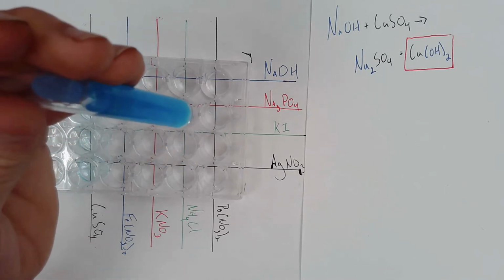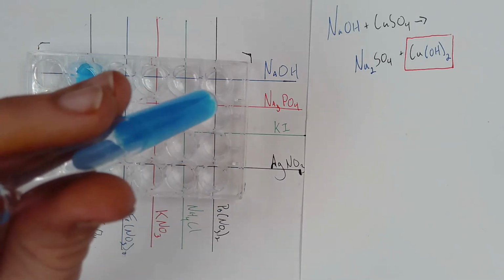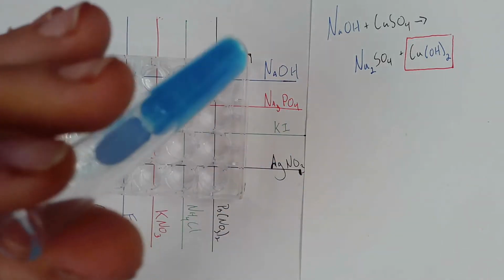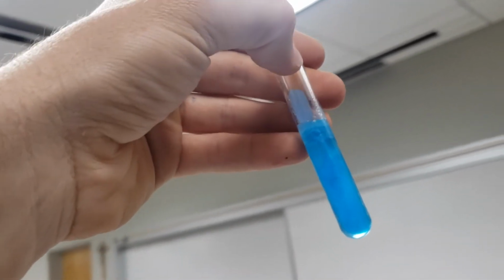Let's cut this for a second and let me show you how a chemist would actually deal with this. Because I'm not sure that's a solid or a weird mixture. I predicted it's a solid. I've seen it enough times that it's a solid, but let's prove it's a solid. All right, so as I hold it up to the light here, it does look kind of solid. And as I bring it closer to the camera here, you can see it's kind of like this opalescent, viscous gel, but I'm not sure that convinces me that's a solid yet, right? Like I want to prove your prediction right.